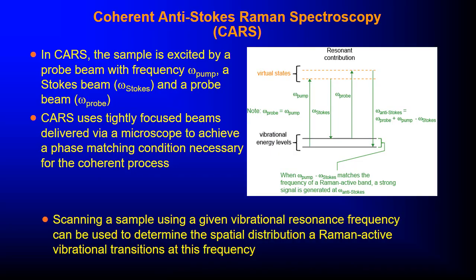In coherent anti-Stokes Raman spectroscopy, the sample is excited by a pump beam with frequency, a Stokes beam, and a probe beam. It uses tightly focused beams delivered via a microscope to achieve a phase matching condition necessary for the coherent process.